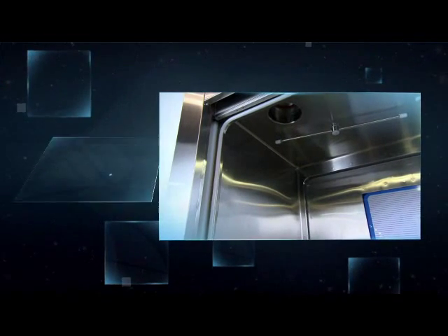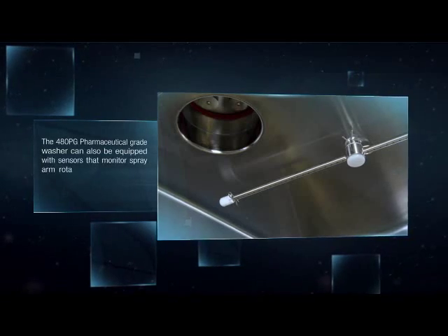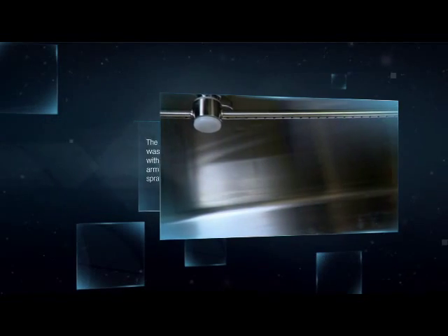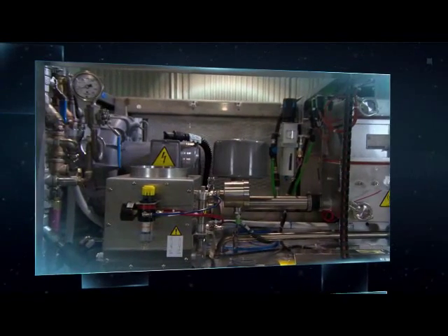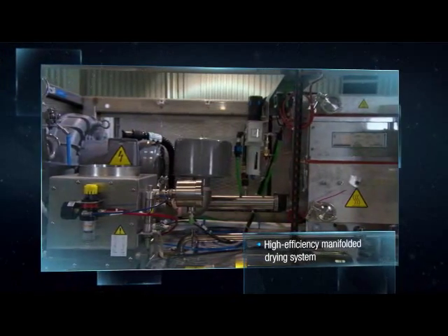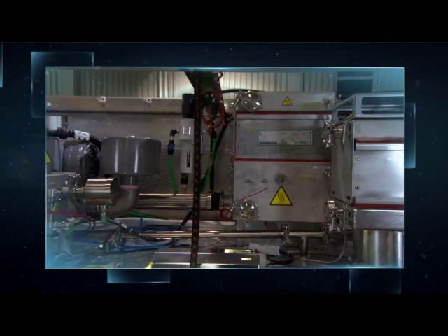The 480PG pharmaceutical grade washer can also be equipped with sensors that monitor spray arm rotation to ensure constant spray coverage of all items in the load. The optional HEPA-filtered high efficiency manifolded drying system ensures that internal and external surfaces are thoroughly dry.